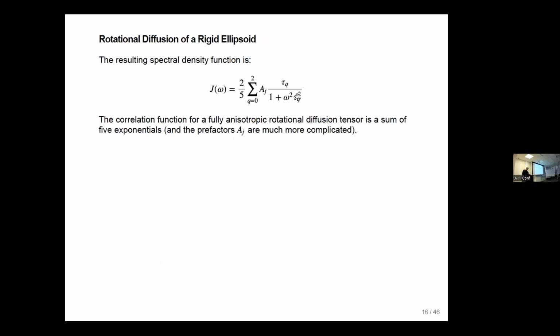Yep. Is it possible to sort of say that the amide CSA is, I mean, I don't know what's the magnitude of the amide CSA compared to the dipole. The dipole is like 10, 11 kilohertz. Mm-hmm. Is there a magnetic field at which I can keep the amide CSA small but have enough resolution to view? Yeah, unfortunately, no.